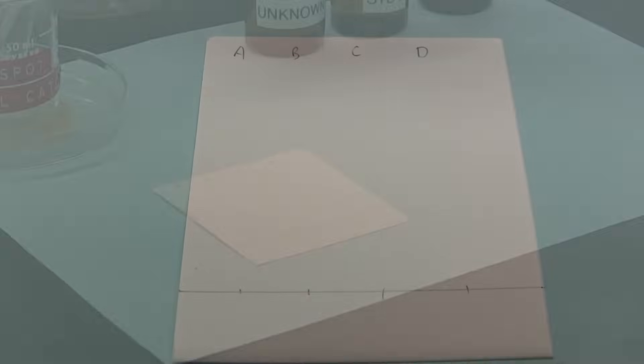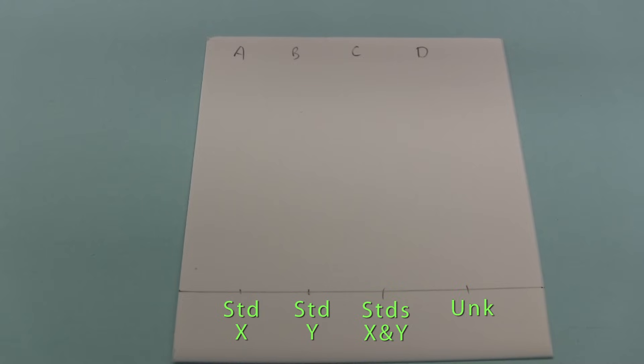So looking at the spotted plate, we have standard X in lane A, standard Y in lane B. In lane C, we have a mixture of standards X and Y. And in lane D, we have our unknown, which is either X or Y, or a mixture of both. Let's find out the composition of the unknown.